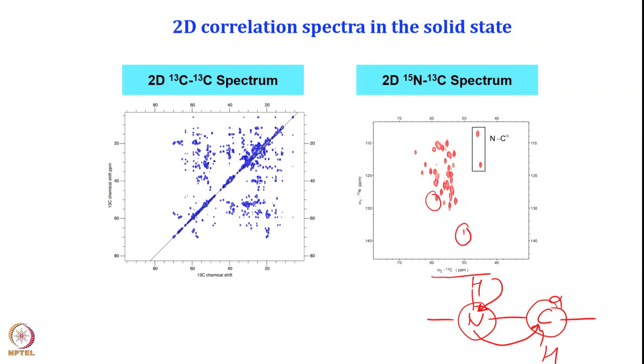If you take any isolated peak, here is a threonine peak, and these are serine peaks. Here you can see the C alpha C beta peak is correlated, here the C alpha C gamma peaks are correlated, and here serine has only two carbons, C alpha and C beta, so that is coming here. These all are actually the gamma and delta carbons of the isoleucines that are there.